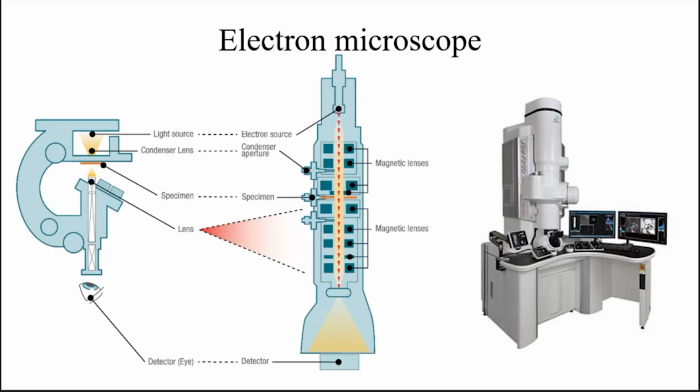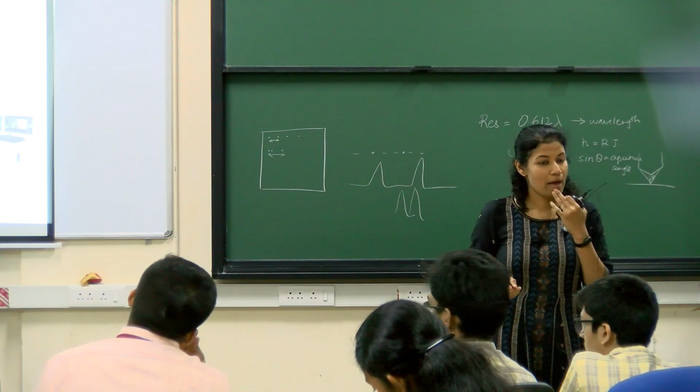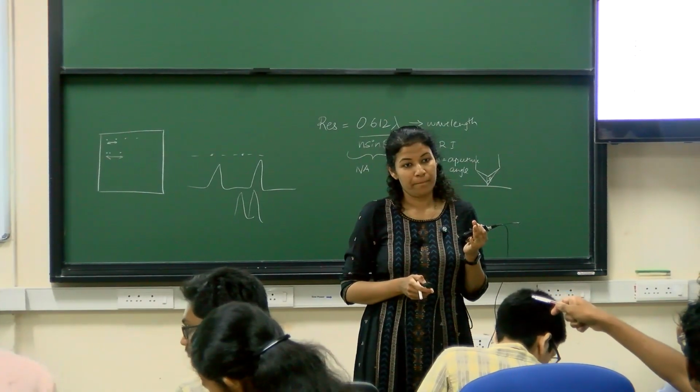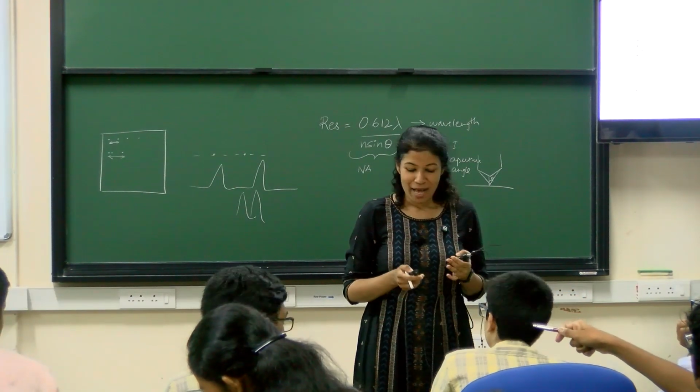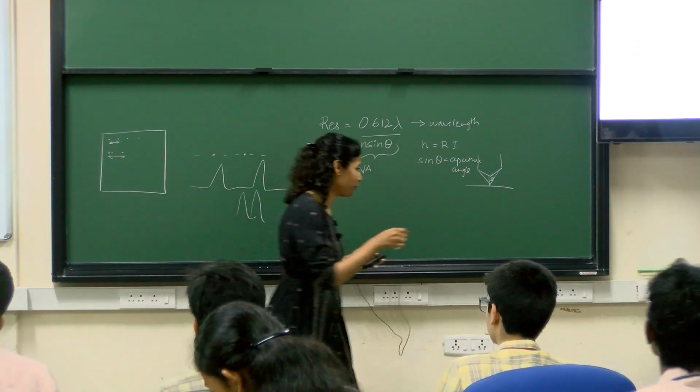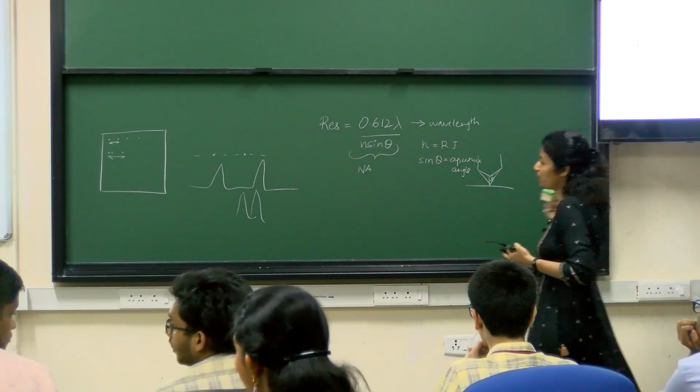Generally, there are different kinds of microscope. This is one of the kinds that you'll see in many departments. So here on the top, you have an electron beam source. Then here you have your sample entry, and then you have an objective, and then you can see the image. Yeah, so that is a difference. So this is transmission. So you have two kinds of electron microscopy that you can do.